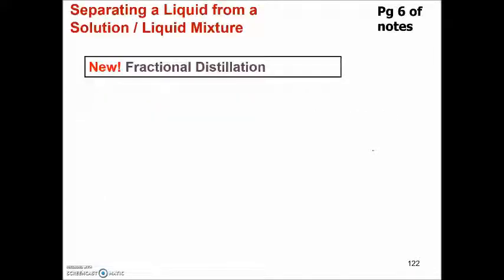Here are your answers. And we are moving on now to fractional distillation. Now this is a form of distillation and it's also used to separate liquids. Now it's not used to separate liquids from a solid liquid mixture. It's usually used to separate liquids from a liquid-liquid mixture.